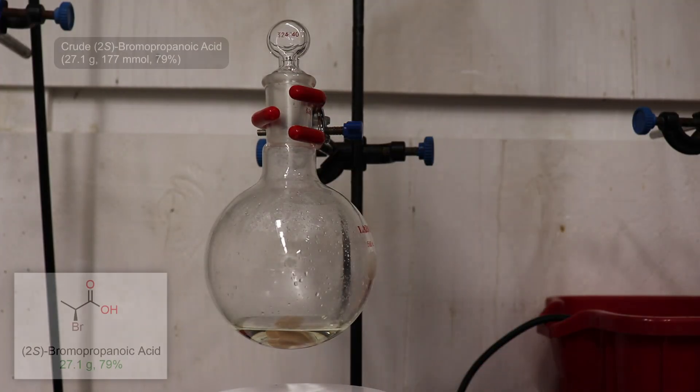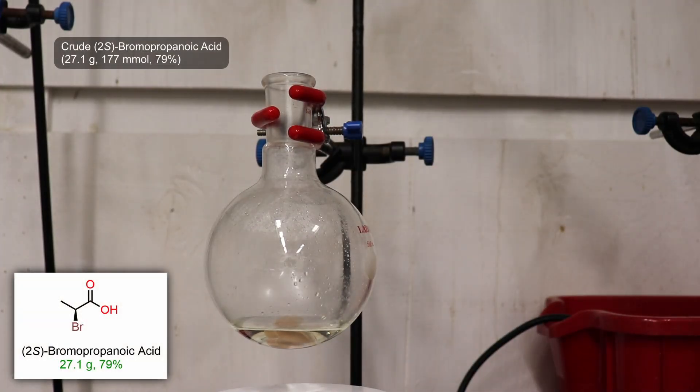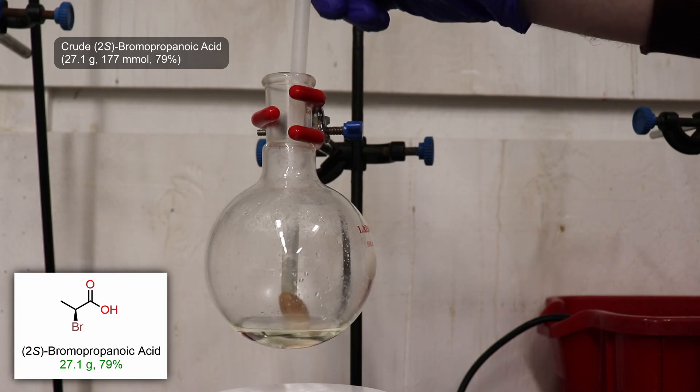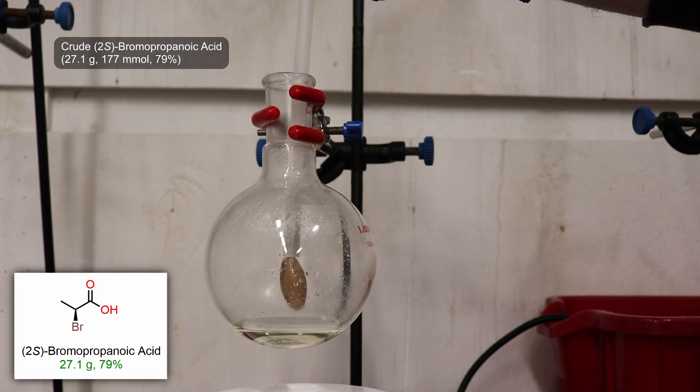From this, I obtained 27.1 grams of a clear liquid with a slight yellow tint. This represents a crude yield of 79% from the starting alanine.